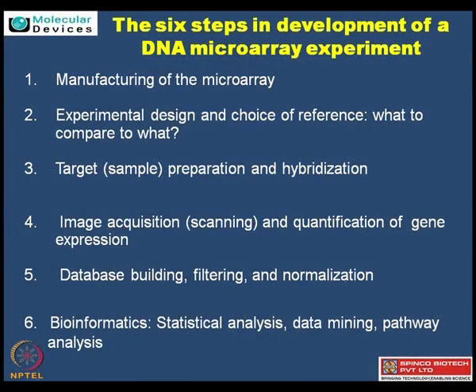After the design is decided, the next step is the experimental design, which scientists usually think through based on the biological question they are asking. Right. Based on that, they choose which reference and which controls are to be studied and group them. Once you are ready with these two, the next step is the sample collection and the target or sample preparation, which can then be hybridized to the pre-planned chip, which is now ready to go for scanning in the form of image scanners.